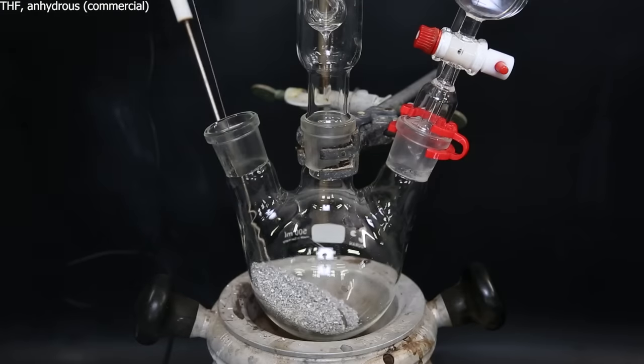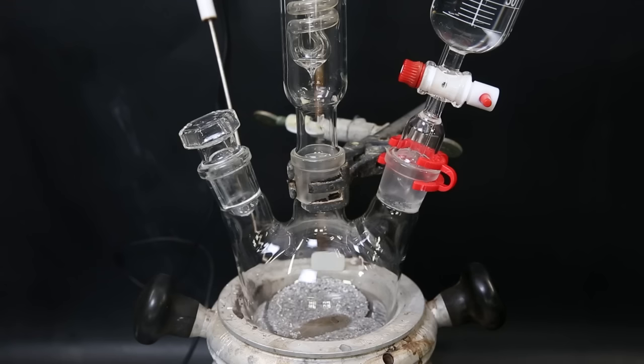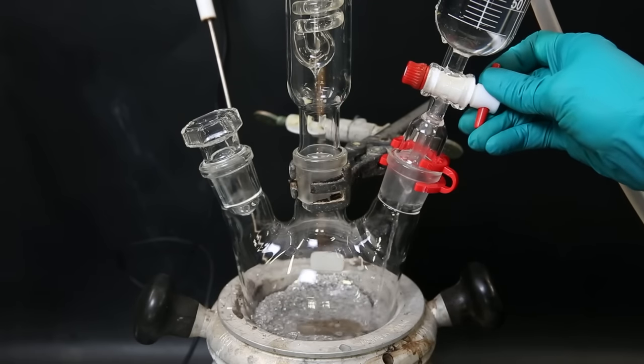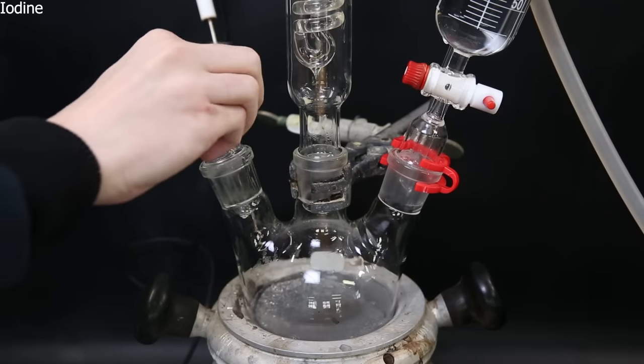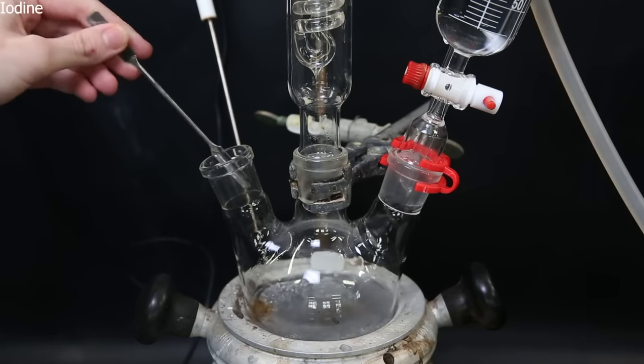I cover the magnesium with a bunch of anhydrous THF and then flush the flask with argon. I stopper the left neck and then set the flask in the heating mantle and start heating it. I open the dropping funnel to let some of the mixture into the flask, and then add some iodine to remove magnesium oxides from the surface of the metal and expose fresh magnesium.